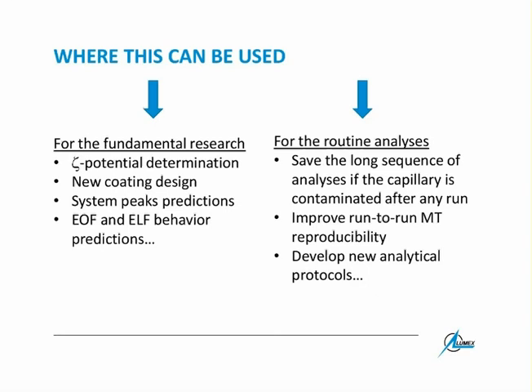You use very short analysis time, just 12 minutes, it's nothing. But of course, the resolution wouldn't be super excellent. But believe me, in many cases, you don't need to make a very fine separation. We definitely have a lot of very good separations, very good peaks, and perhaps I will show you now this separation, how it is done.